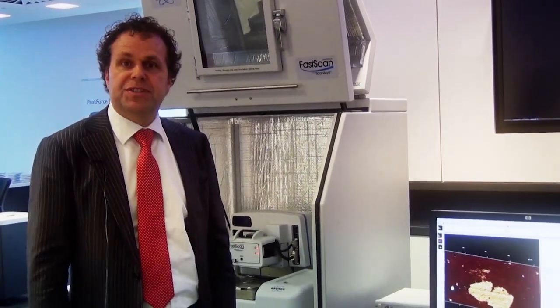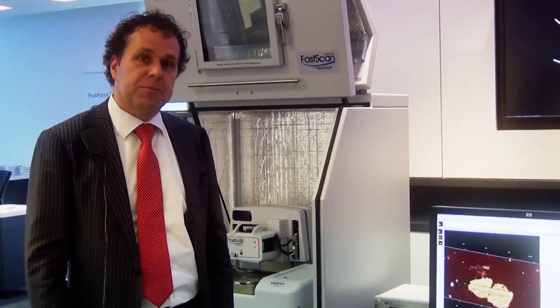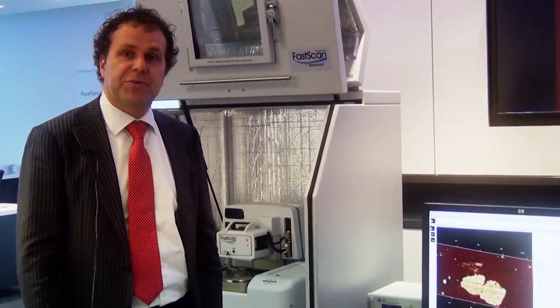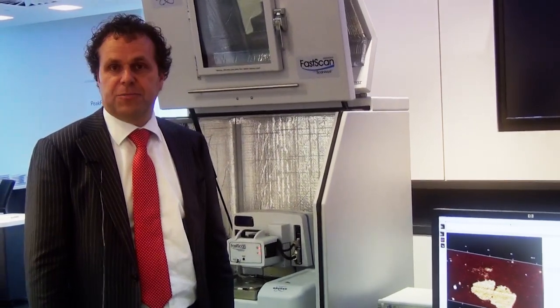Already from day one we've seen the effects. When somebody comes for a demonstration for a Bruker AXS instrument, they get a short tour in our lab as well and the other way around, and that is very helpful.